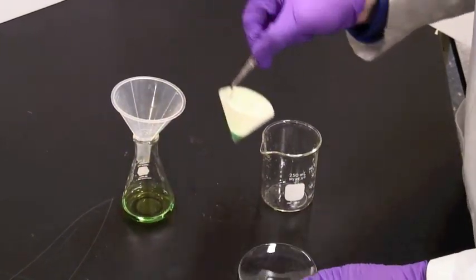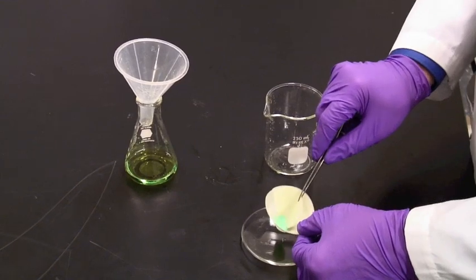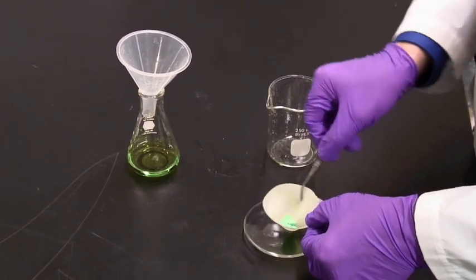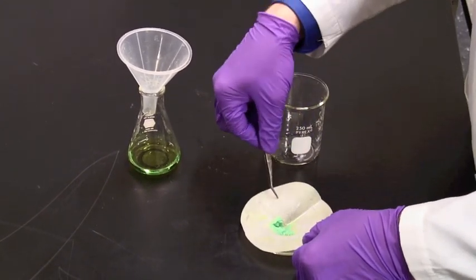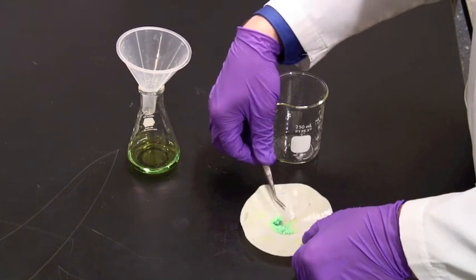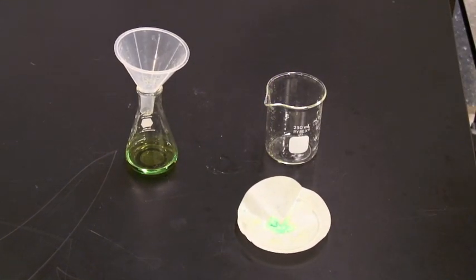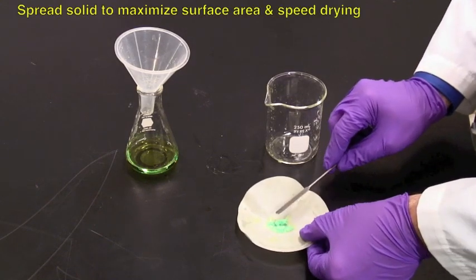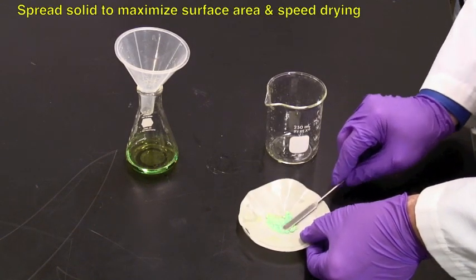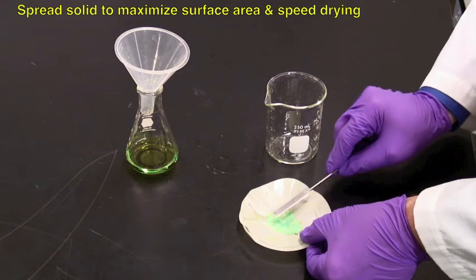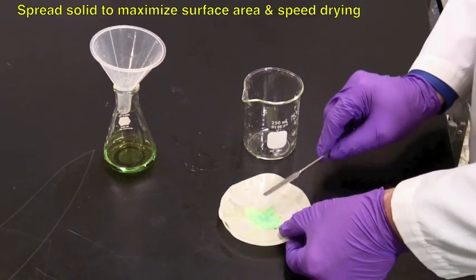Then, take the filter paper out of the funnel and spread it open. If you put this on a watch glass, it will dry more quickly. Sometimes, if you can spread the solid out, you will also get a better drying time by increasing the surface area.